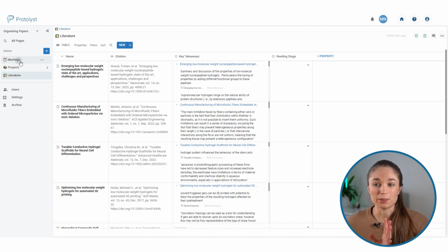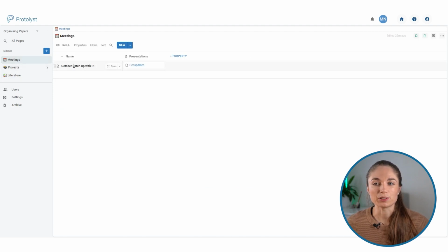So let's jump back into the meetings table. So you can see here I've got a row already in the table for the October catch-up with my PI. And I've also uploaded a presentation that I went through during that meeting. So let's set up the meeting for a November update with our PI.